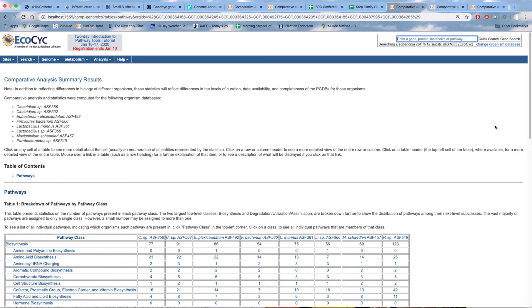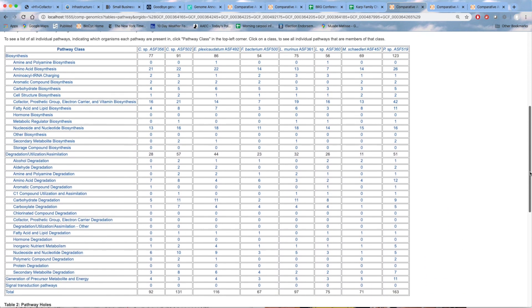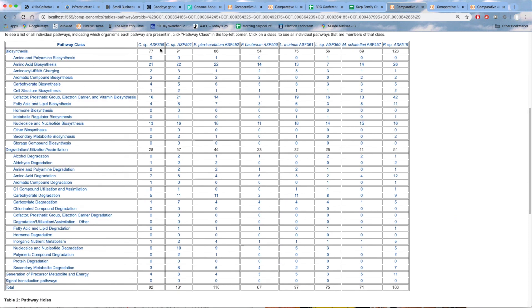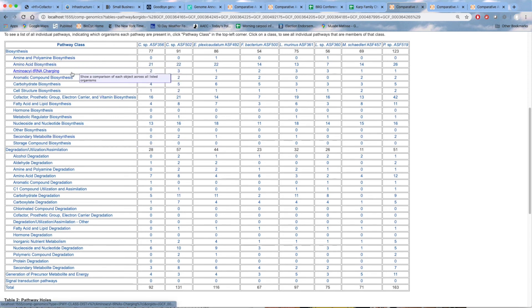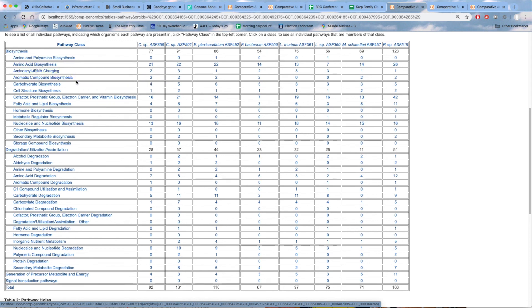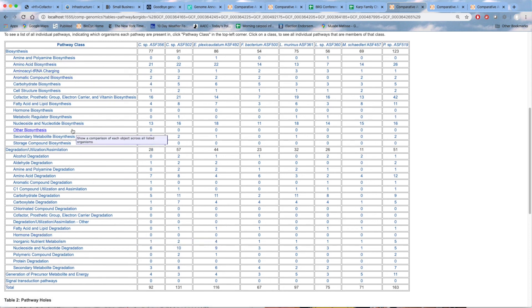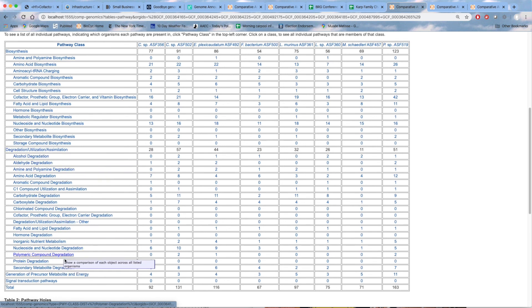Now we get a pathway comparative analysis result where the columns in this output table are all of the organisms and the rows are different classes of metabolic pathways. The first row summarizes the number of biosynthetic pathways present in each organism. Subsequent rows break down the number of subtypes of biosynthetic pathways: amino acid biosynthesis, tRNA charging, aromatic compound biosynthesis, et cetera. Then here are all the utilization pathways, energy metabolism pathways, et cetera. Then we get total pathway counts across all the different organisms.